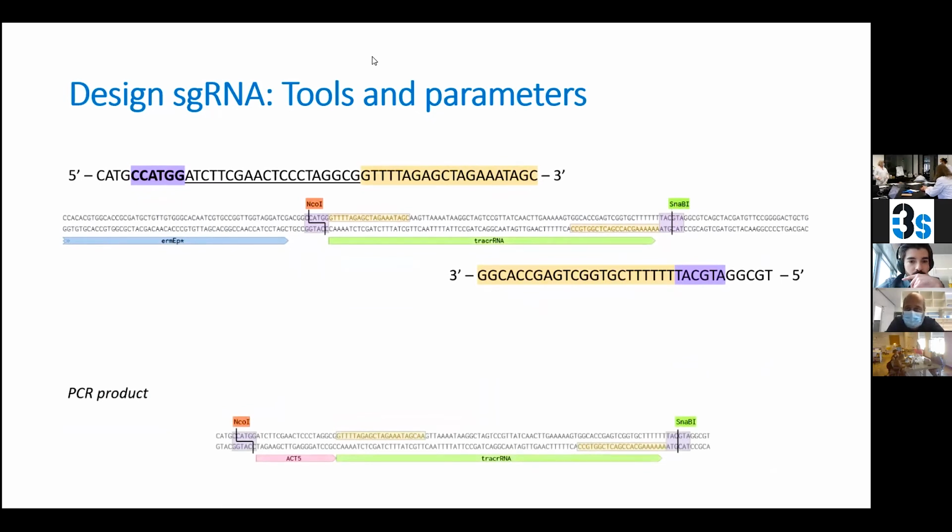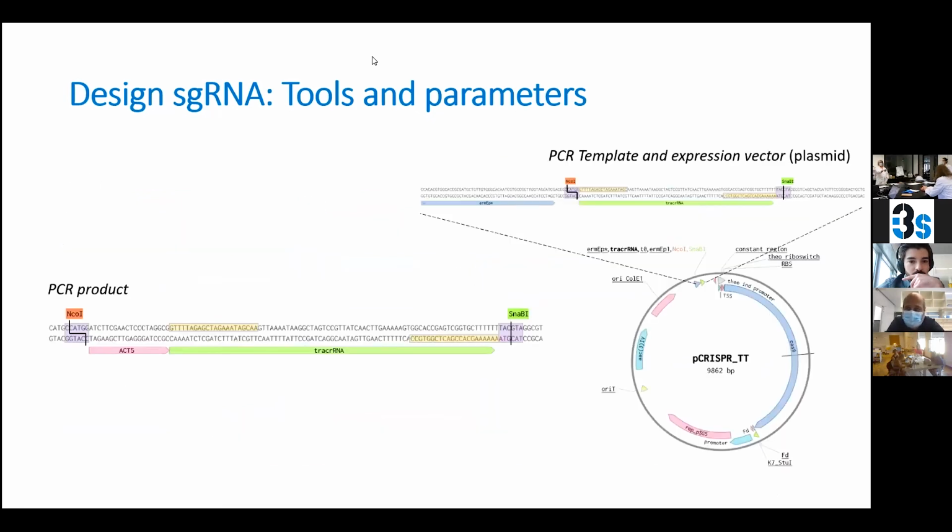And you, Biophilia, would you like to do this afterwards? Yes, very much. We have every facility here except of course the primers and the plasmid. So if we can get the plasmid, we are good to go. Okay, I think this could be a challenge to do also. Please, Fabio, continue.